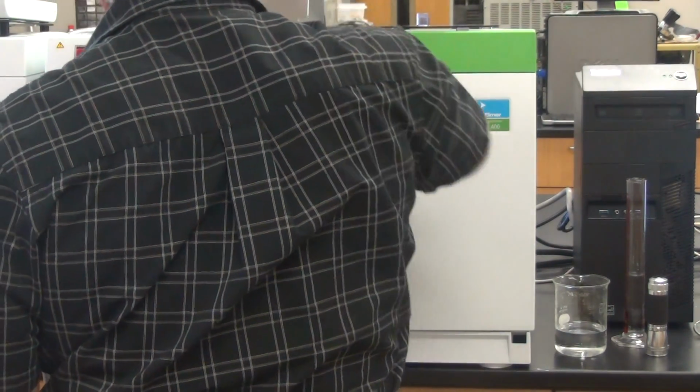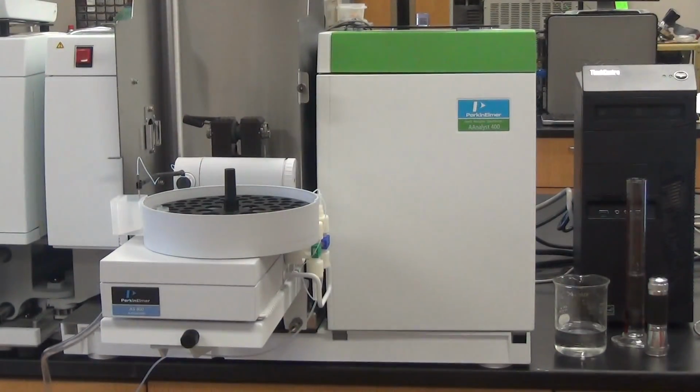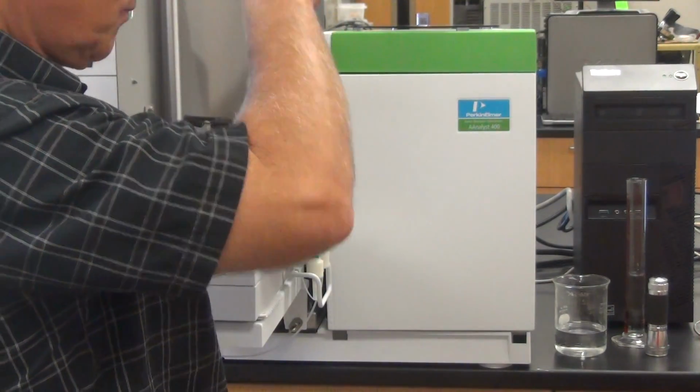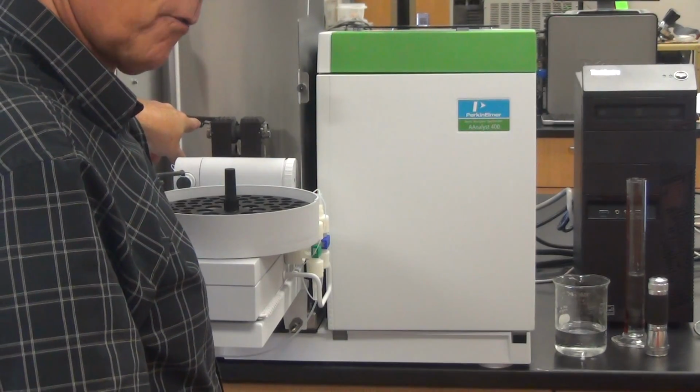This is a pyrometer, and you had one right here, the same thing. When you deal with a platform, you tell it to get there as fast as possible. So when it starts the program, it's going to go up to atomization temperature. It's going to read a voltage from this, and it helps it minimize overshoot.